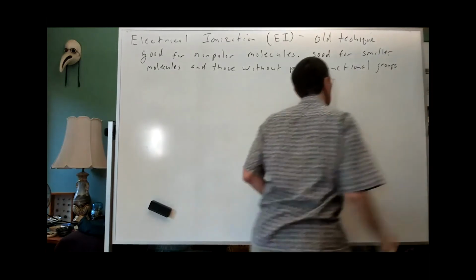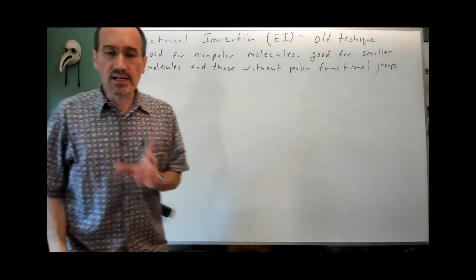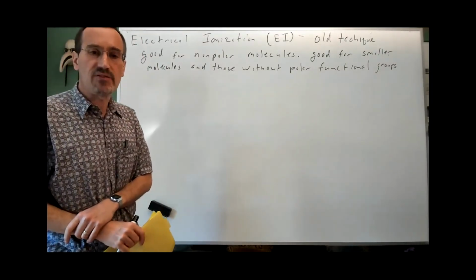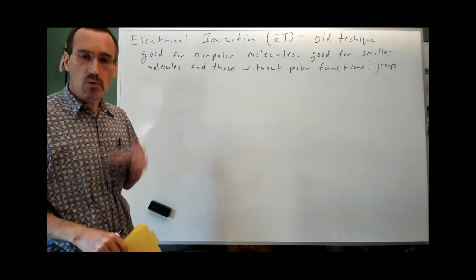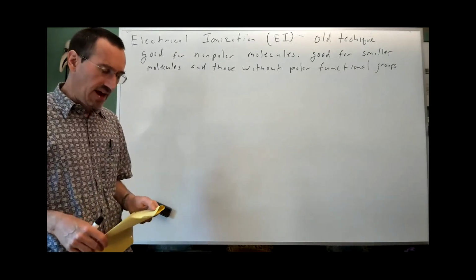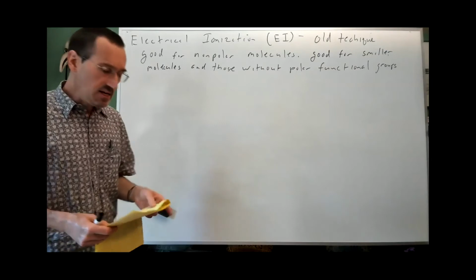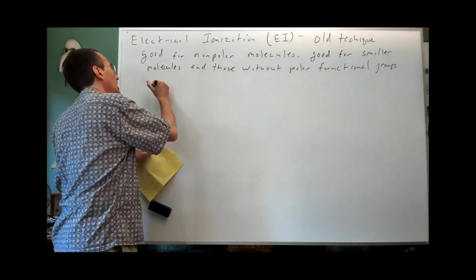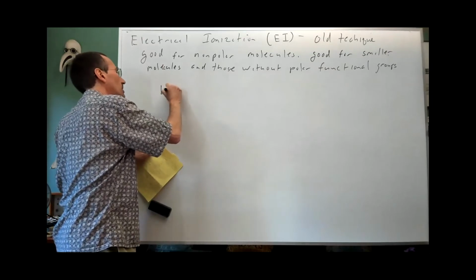The reason I say this is you've again got to heat the molecule to get it into the gas phase. So you heat it on a filament in a vacuum, and then you bombard the molecule with electrons to knock out an electron.